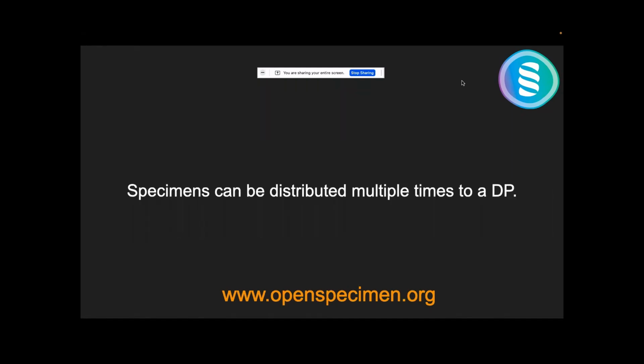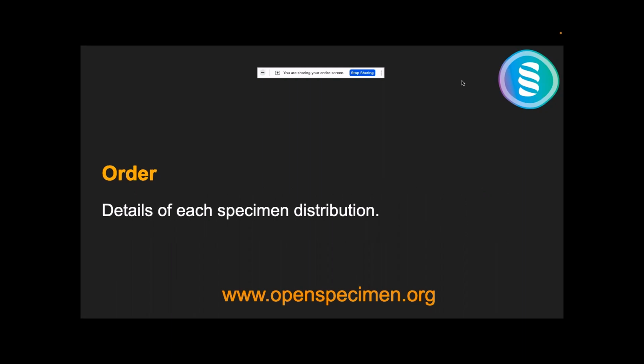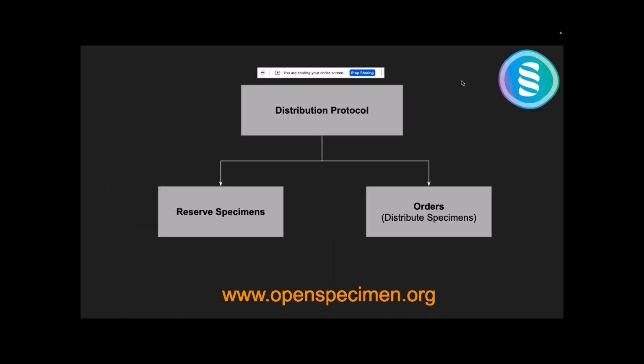The specimens can be distributed multiple times to the same distribution protocol. As I said, the information comes as a pre-filled form kind of thing, and you can reuse the same distribution protocol again and again. Whatever your common researchers or vendors are, you can create one distribution protocol for each of them, or one institute, something like that. And an order is nothing but the details of each specimen that is distributed.